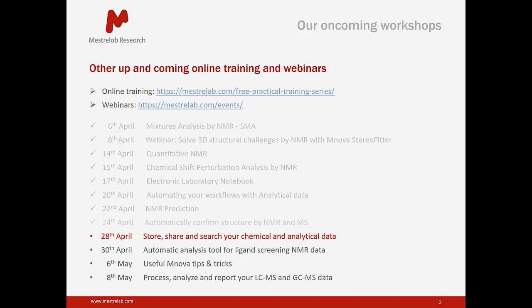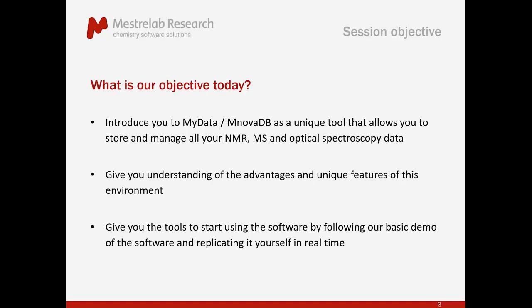There have been 8 previous sessions already. And if you're interested in any of those and you happen to miss them, you can contact us for the videos, or you can go to that page on the top, online training, mestrelab.com/free practical training series. And there you can register and request a copy of the video of the session. Okay, so without further ado, let's talk about today.